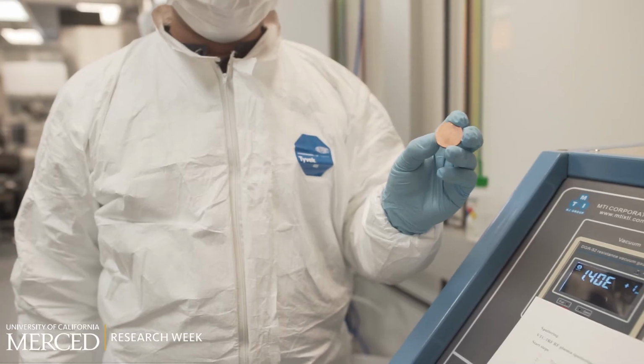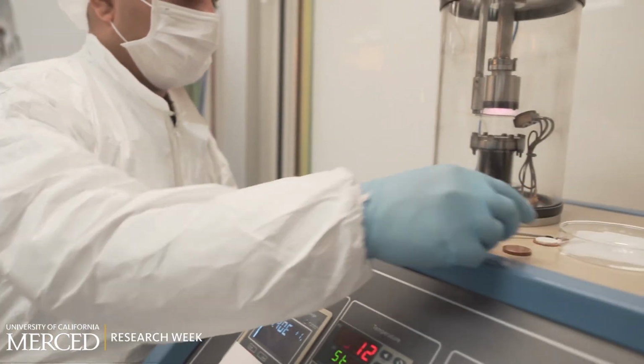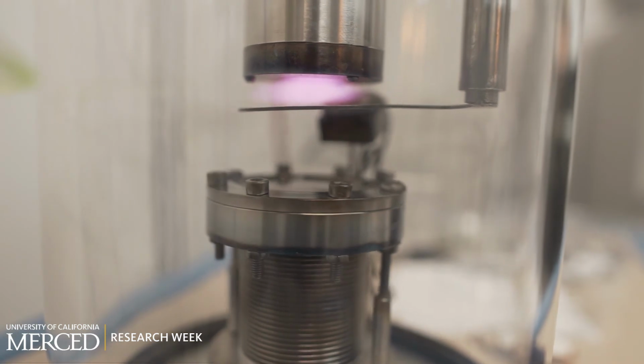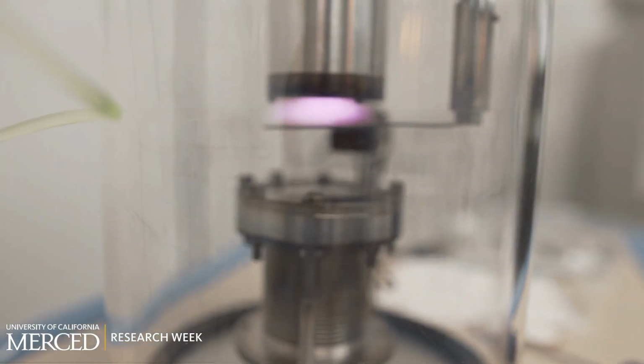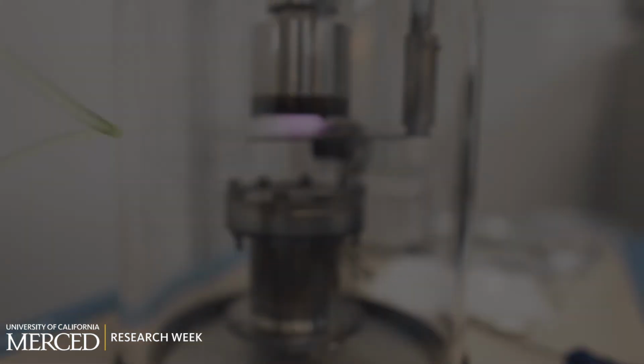In our facility, we have platinum and copper targets. This system is capable of depositing oxide and other metals. Here you see plasma of platinum, and this can eventually be deposited on any wafer.